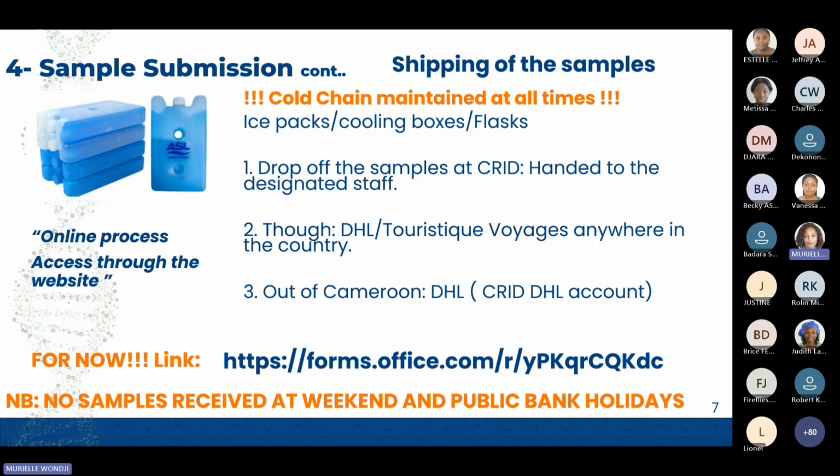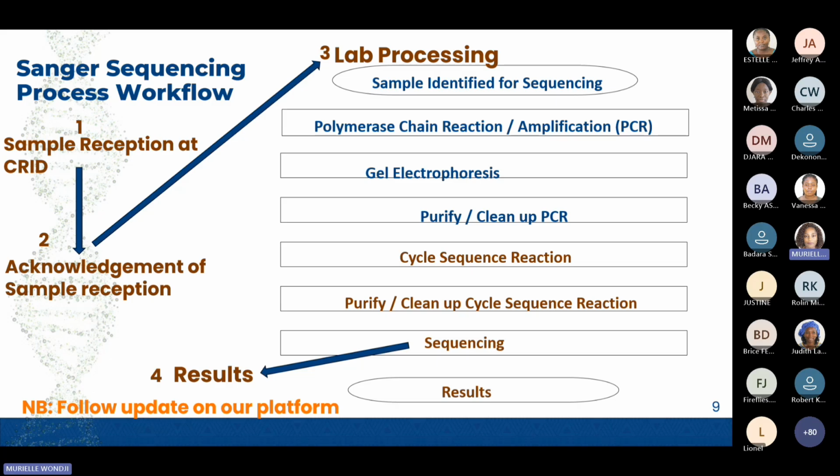We do not want to receive samples at weekends or public holidays. So while communicating with us, we will plan for the shipment together to avoid this disagreement. Now, once the samples are at CRID, you can follow these different steps on this slide online.